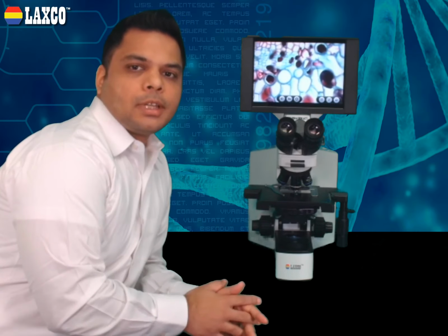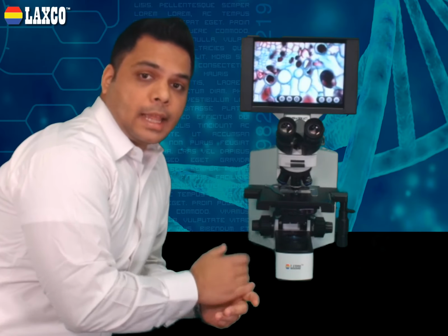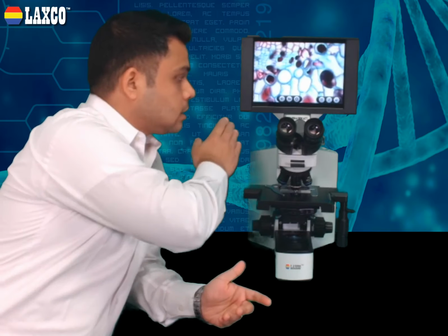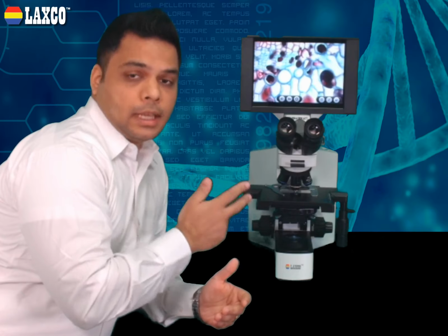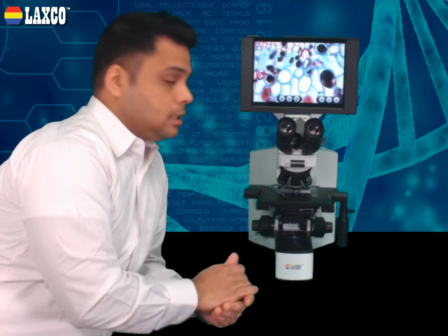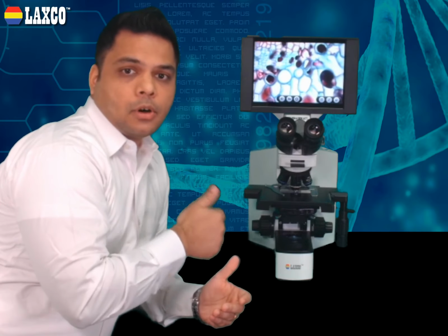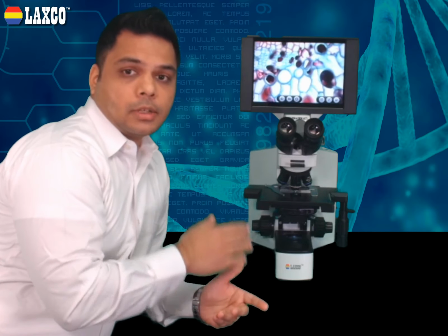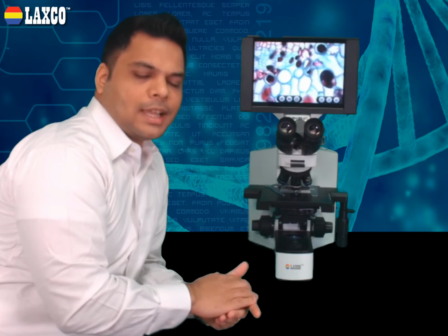Let's know a bit more about the microscope. The microscope itself allows you to image samples under bright field and phase mode. It's versatile. It has a 16 megapixel high resolution camera. It has a touchscreen tablet which allows you to view, capture, and save all your data. The SeBaView software on the tablet allows you to annotate, record, store data on the cloud, and a lot of other cool features. Let's take a closer look at a few of those features.